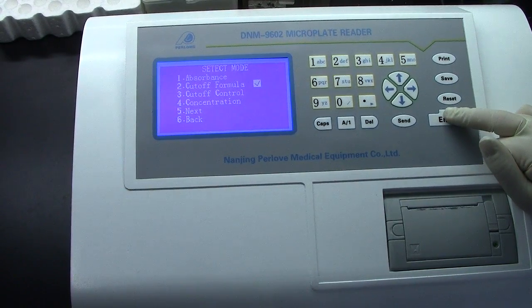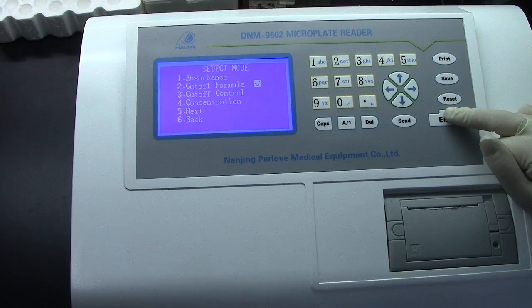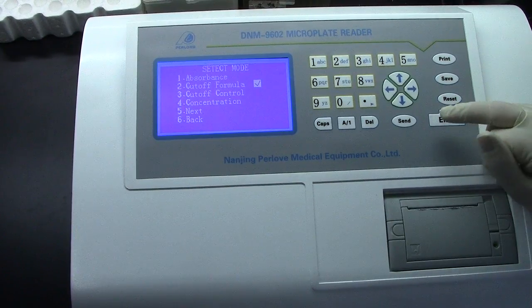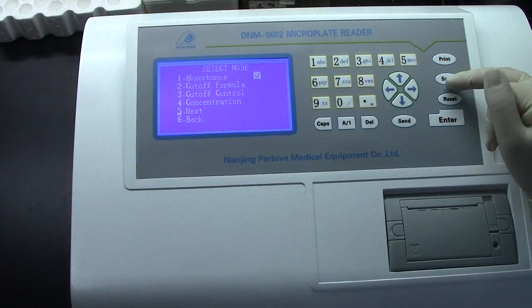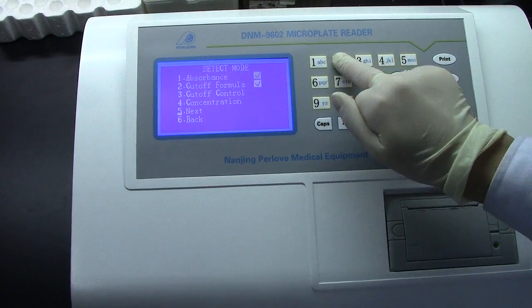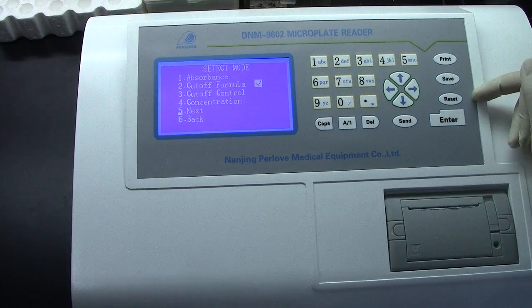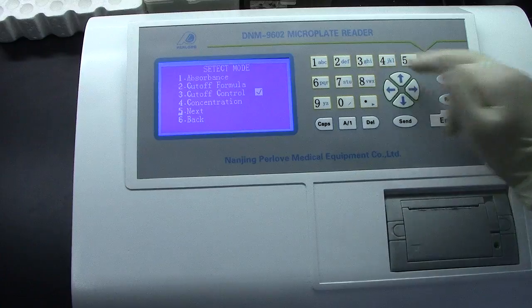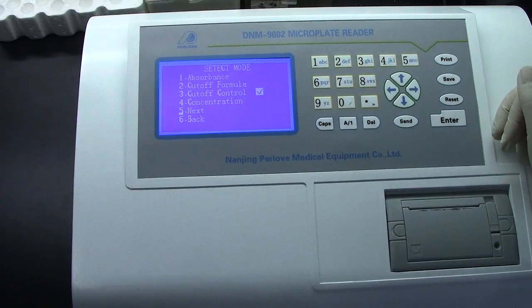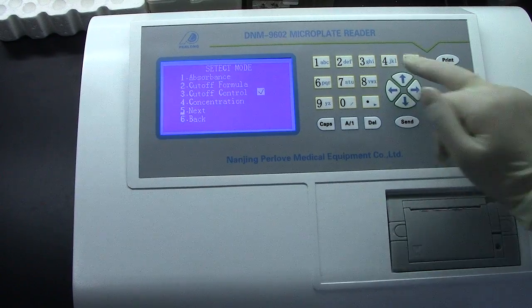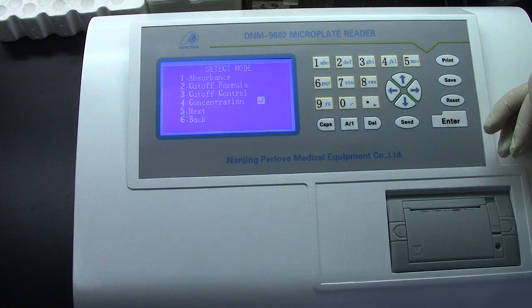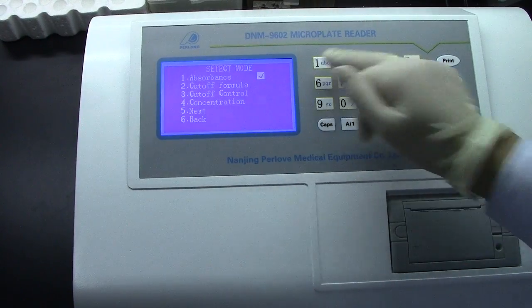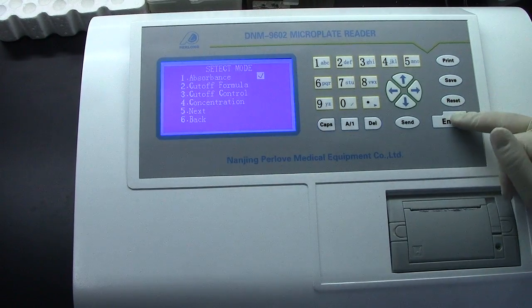Detect Mode — it has 4 options: 1. Absorbance, 2. Cut Off Formula, 3. Cut Off Control, 4. Concentration. For this program, we need to use 1. Absorbance.